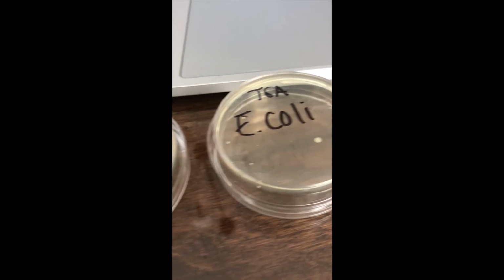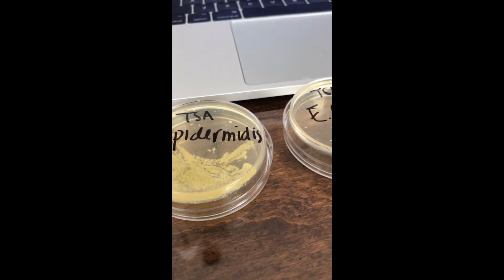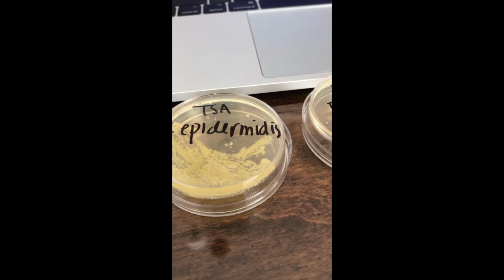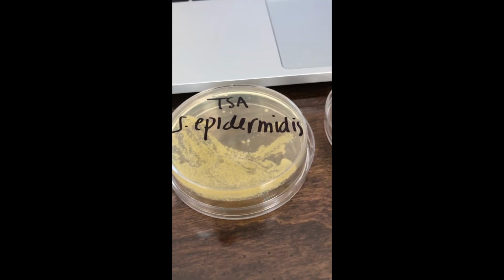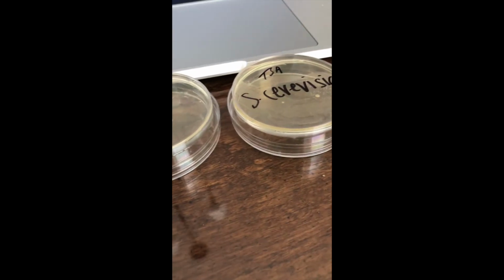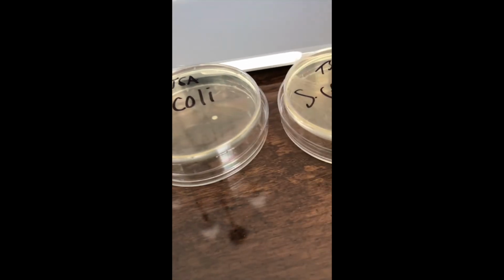It was very hard to actually see where the inoculation loops were on the agar from the samples and then back when spreading. I think this was actually the last one that I did, so it might have been the most successful practice of the 3. And maybe if there was more allotted time, these would grow more. So we'll see if this changes for future experiments.